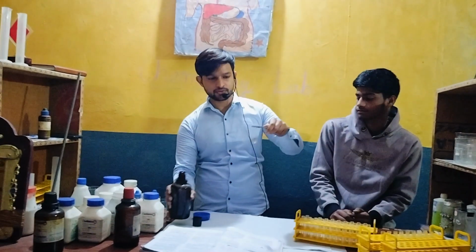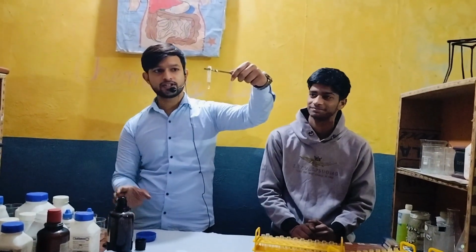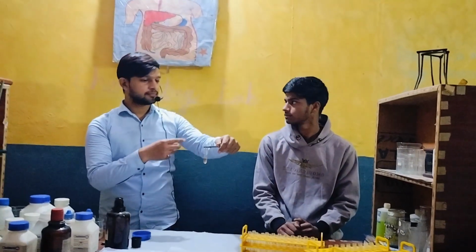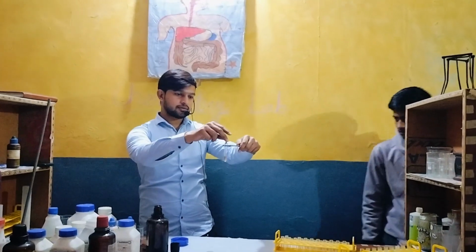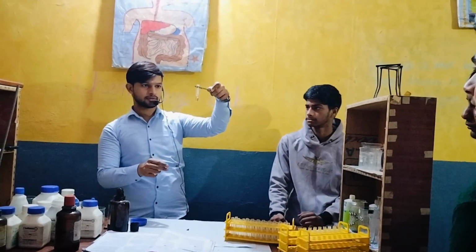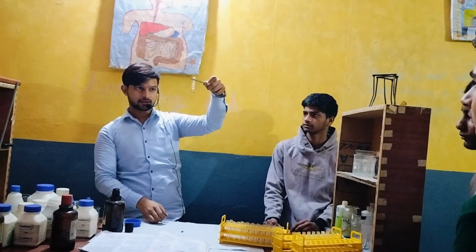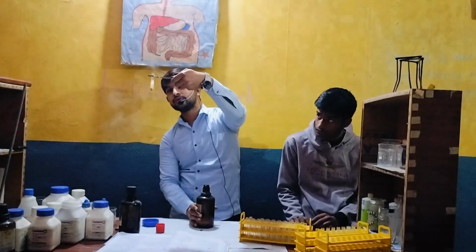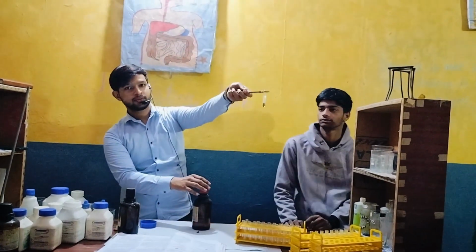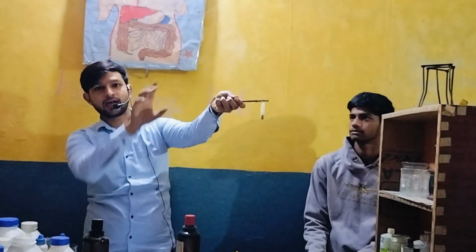So this is sulfuric acid, H2SO4. Now we will place zinc. See, you can see hydrogen gas. Now you can see. Yes. Please zoom. You can see this is hydrogen gas.